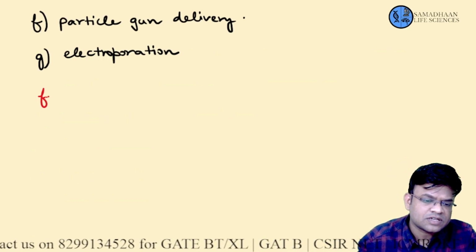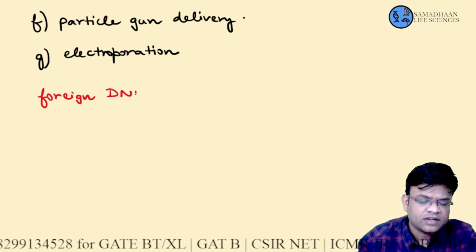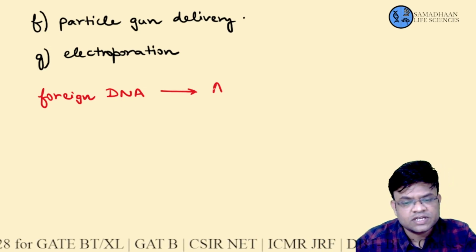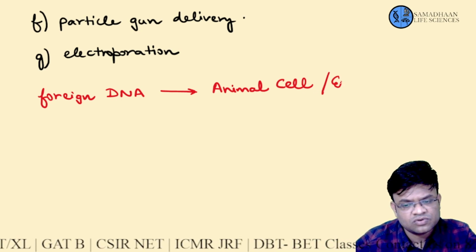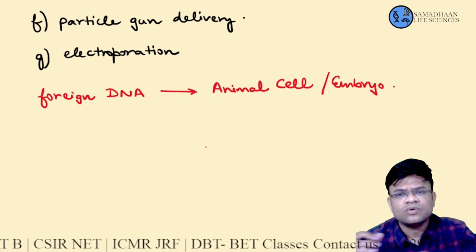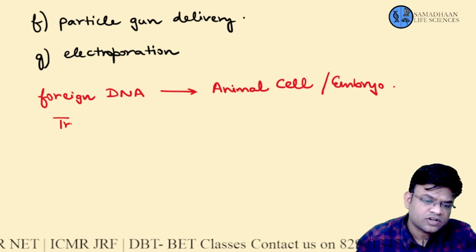A foreign DNA is introduced inside an animal cell. Now this is an important point. When the foreign DNA is introduced inside an animal cell, or you can also mention embryo over here, it is similar to the process of transformation.